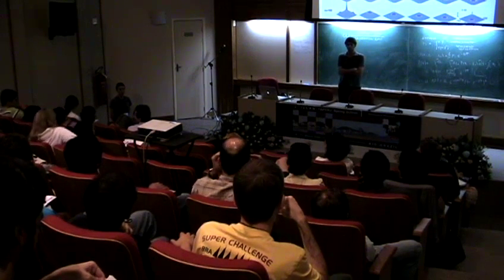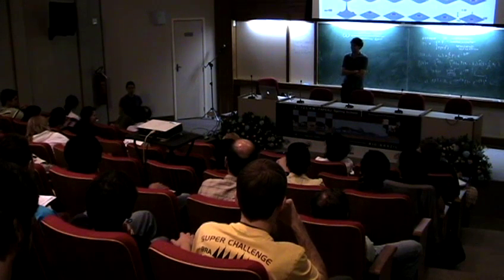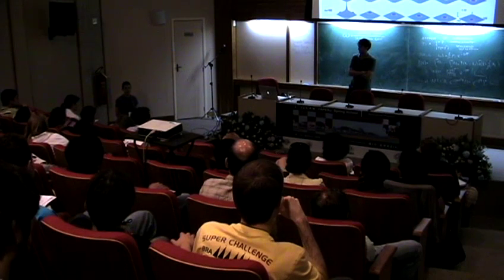Well, there's some proportionality to the ATP concentration. It can be done, but it is more complicated.